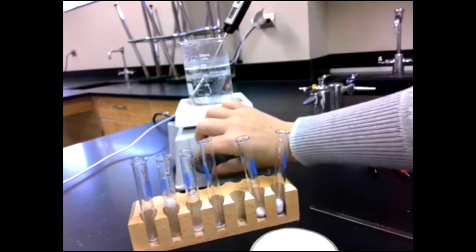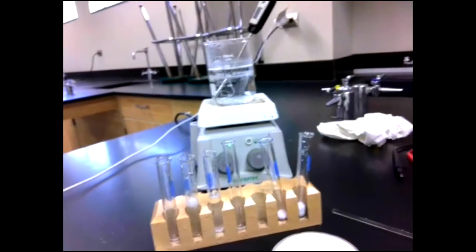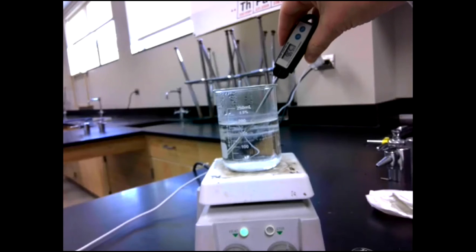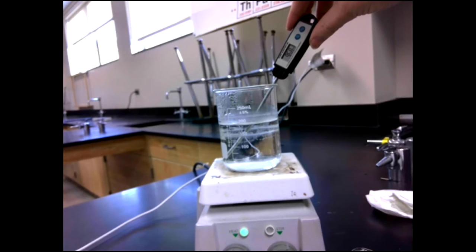It's not quite boiling. Go a little bit closer. It is 96. We'll let it get, it hasn't gotten above 99. So I think our thermometers are not quite right, because it should be 100, but we'll let it get up to 98 or 99, 97.